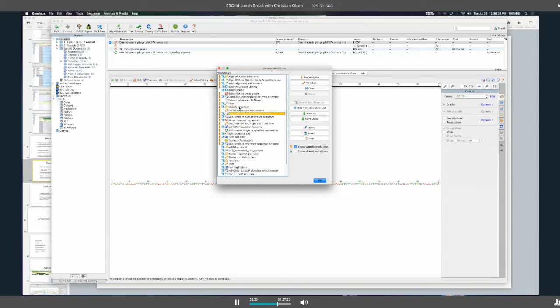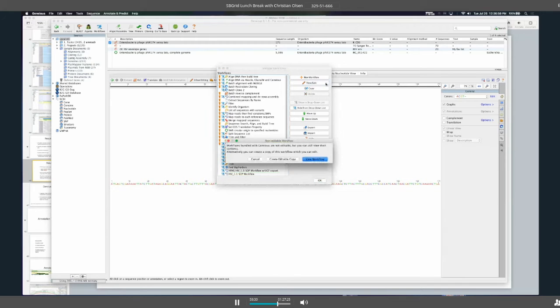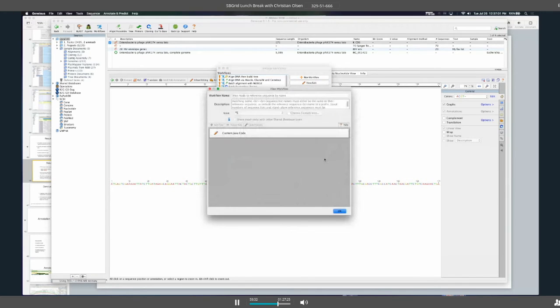So here I'm showing all sorts of workflows that were added. I've got a workflow that one Geneious user, David O'Connor, who's a Zika virus researcher, he created and published a Zika workflow in Geneious called Zquencher. Okay, and you can go to his website and download it and run it. Okay, I've got an HIV workflow that I created, as well as a number of others. Okay, so if I'd like to examine a workflow, I can just select it and click on View Edit.